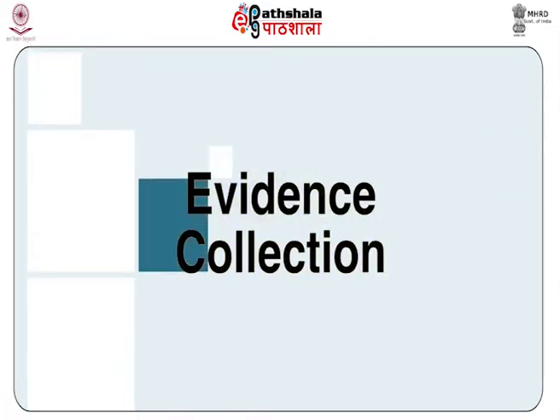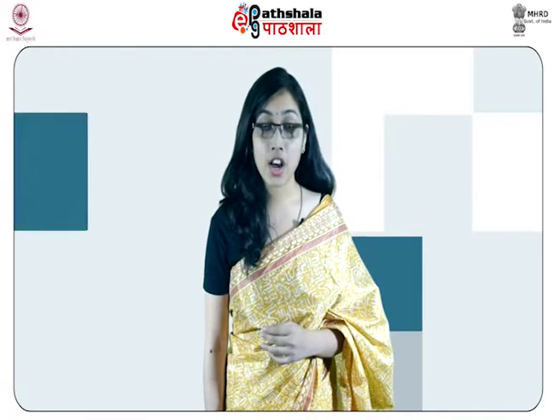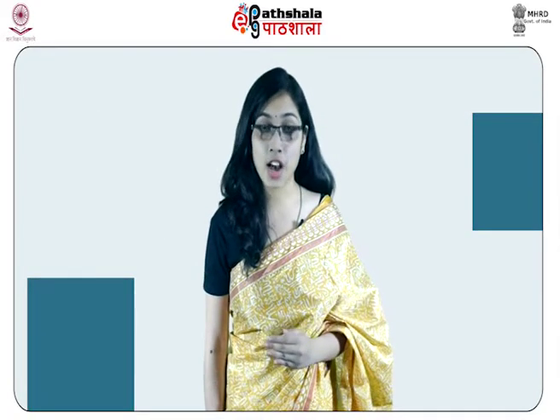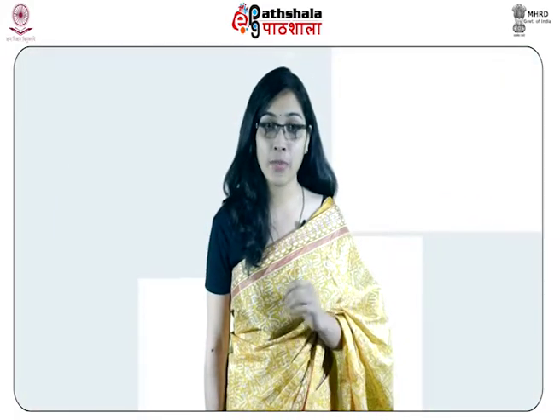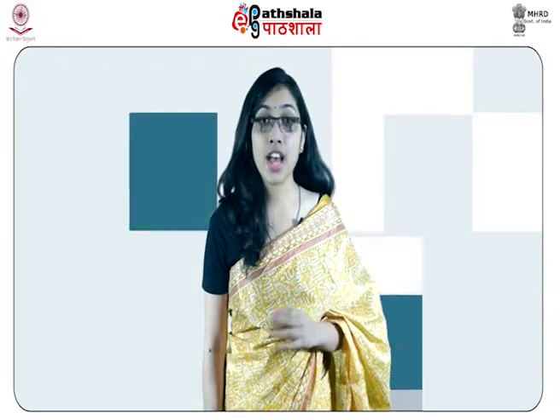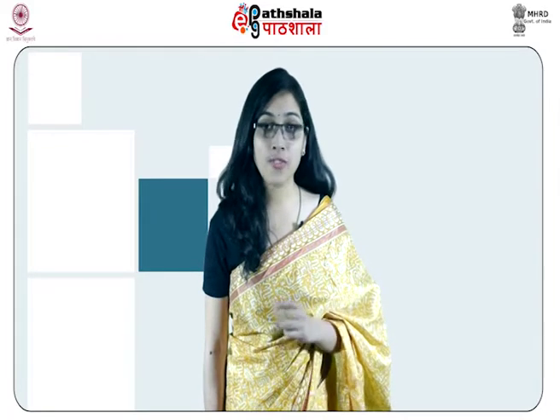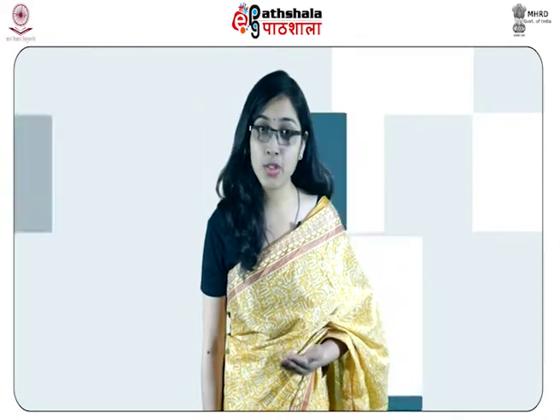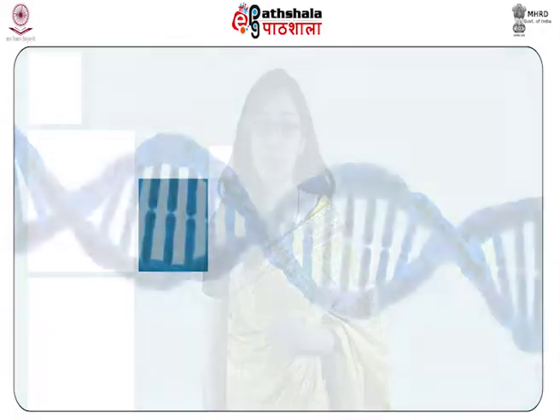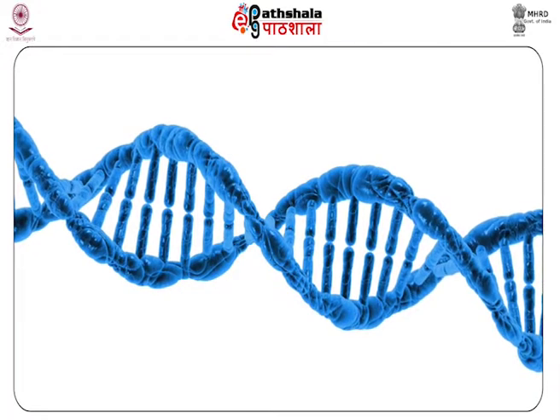Next, we will study about the evidence collection. The collection of evidence should be carried out in a careful manner to prevent any sort of contamination and degradation. Careful handling ensures integrity during all phases of investigation. The materials or tools used for the collection should be free from human DNA because DNA cannot be destroyed by all germicidal treatments.